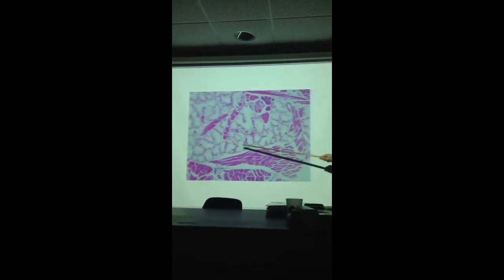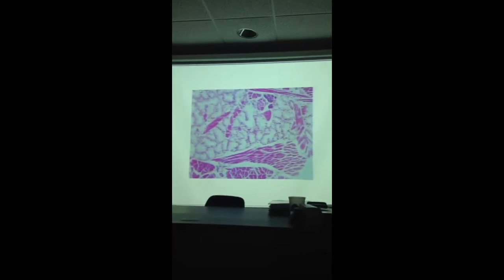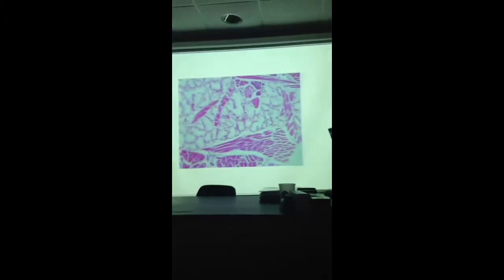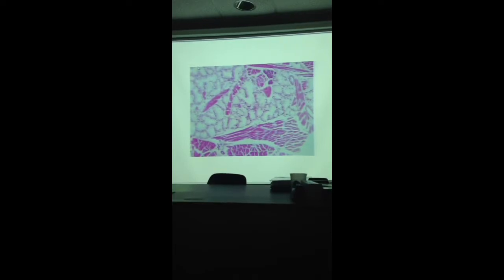What are these cells? These are the mucus cells. Okay, they're usually lighter stained. What kind of secretion do they produce? They have a lot of mucus. Okay, mucin. All right. So this is a thick viscous secretion, low in enzyme.